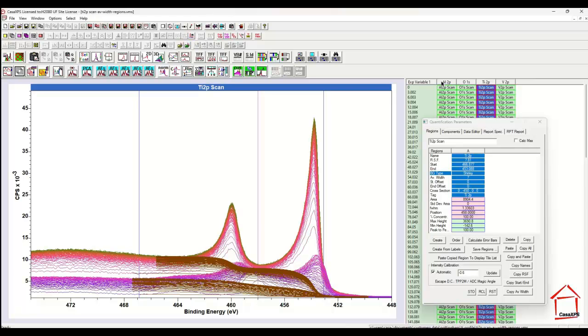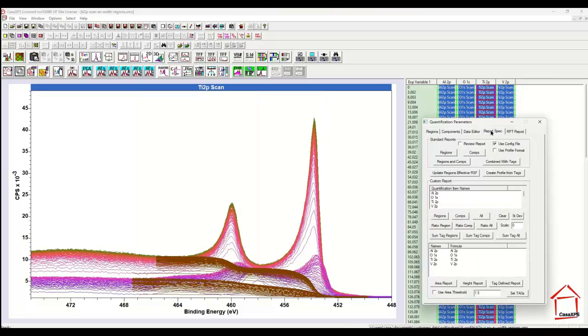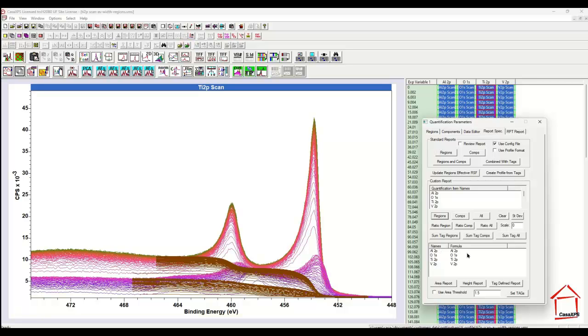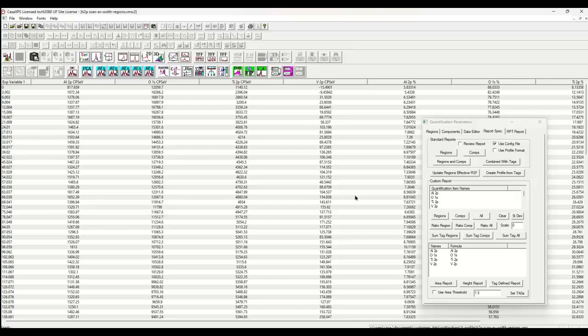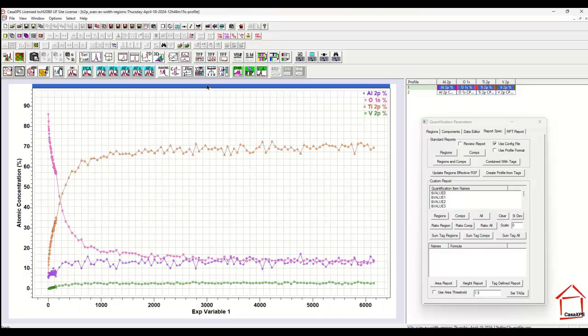So in the metal I have a different start and end from where the oxide is. Once I have all these regions set up on the data, I select the data, go to the report spec page and then transfer the region names into this name column custom report and press the area report. And this produces a table which I can convert to the profile.